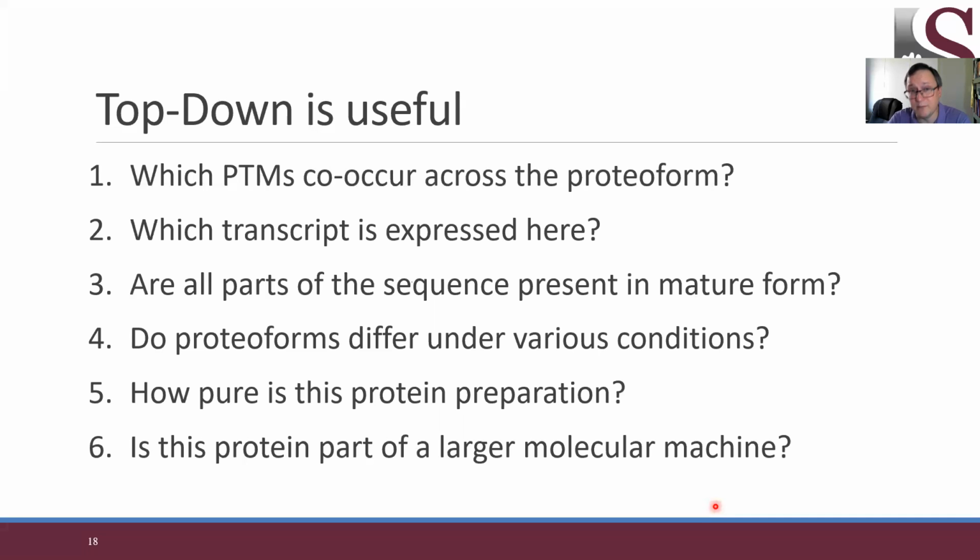These are really important biological problems, biological challenges that creep up in a huge number of categories. And in most of these cases, shotgun proteomics has important drawbacks that prevent us from using it for that.